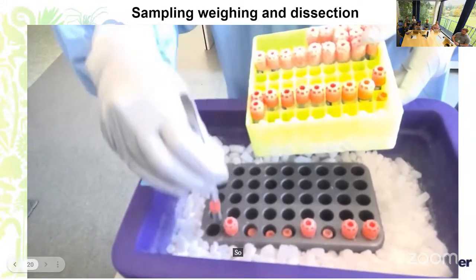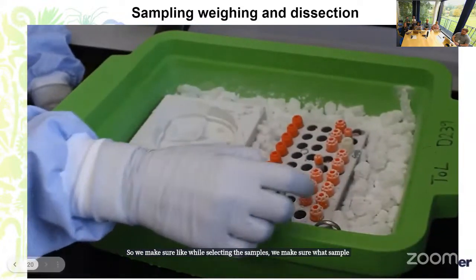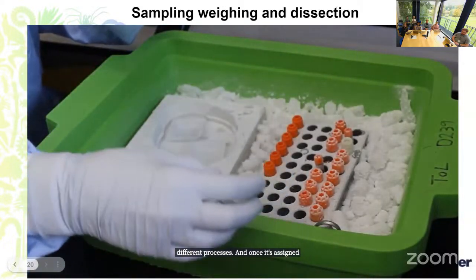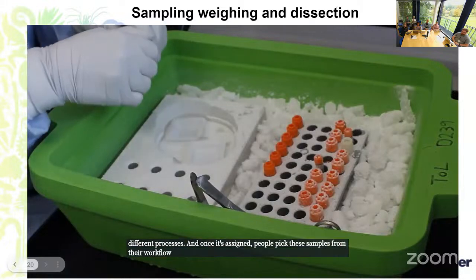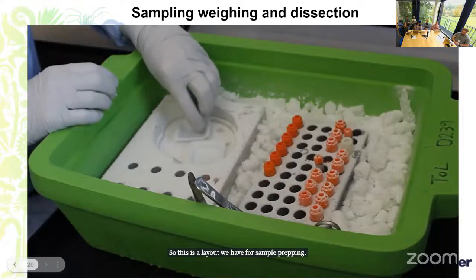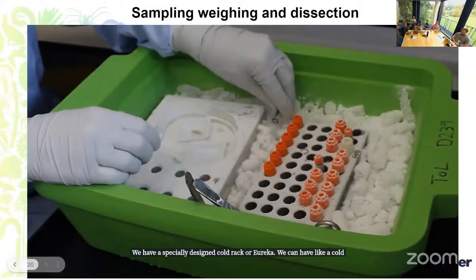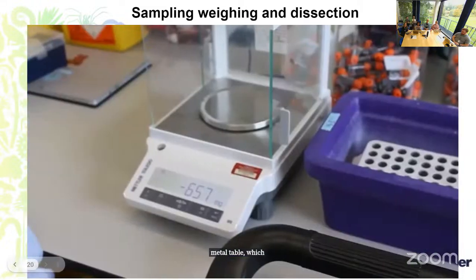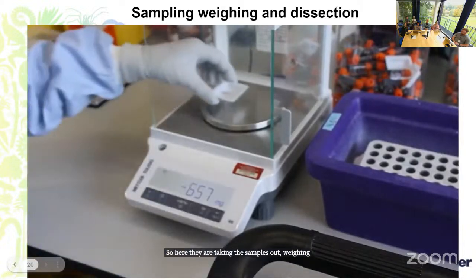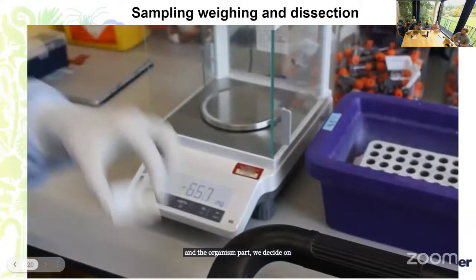While selecting the samples, we make sure what sample and what individual goes through different processes. And once it's assigned, people pick these samples from their workflow and start working on the sample preparation process. So this is the layout we have for sample prepping. We have a specially designed cold rack, or a cold metal table, which is used for the dissection process. Here they are taking the samples out, weighing them, and then based on the weight and the organism part, we decide on what downstream process it's going to go through.